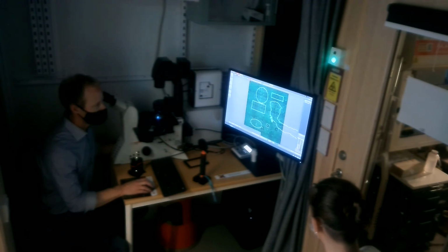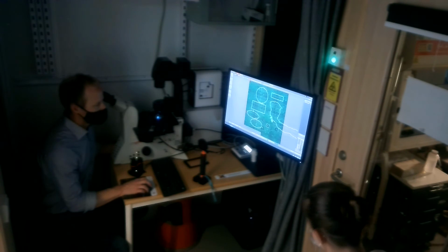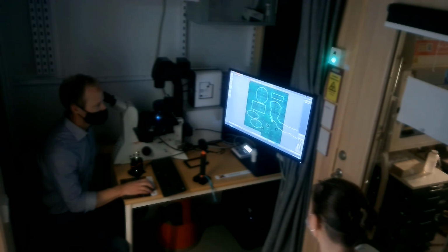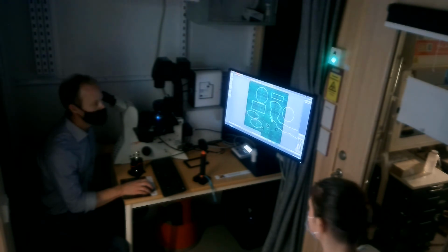This is very okay. Let me just check this because yeah. So, stupid. The circle, you click and hold and drag. I think this might be a bug. And then you release. Whereas the other ones, you click once and then you drag it and then you click again when you want to release it. I'm not really sure. I think that's something wrong in the program, actually. I was surprised.